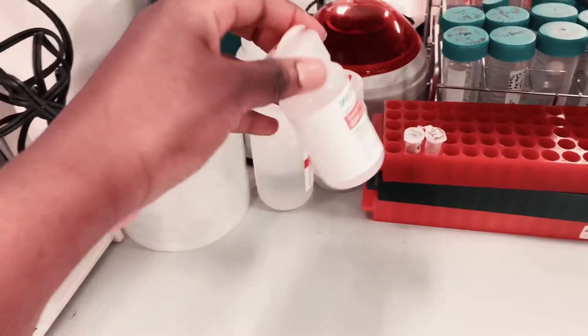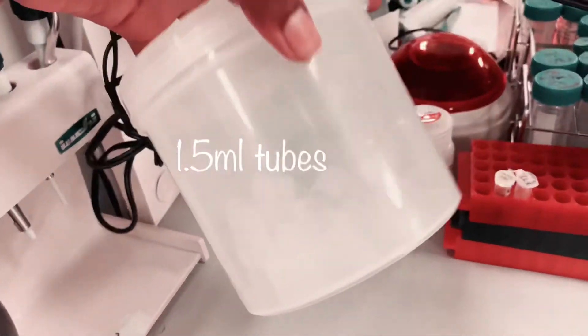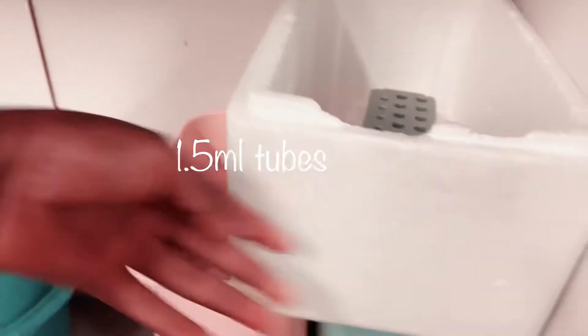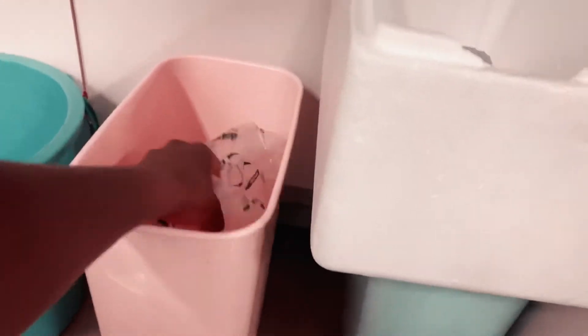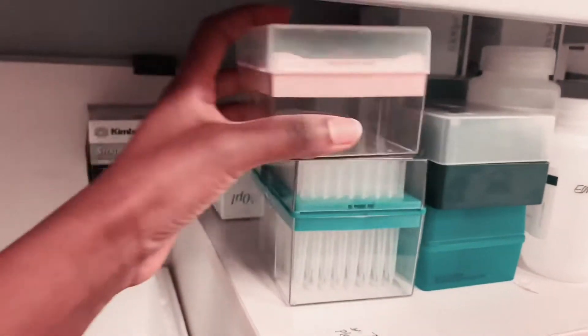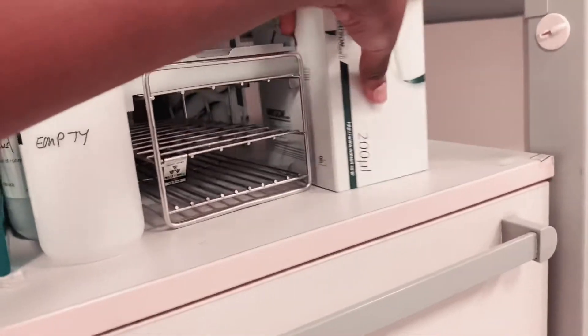I have my tips, my tubes, my solutions, my reagents, my racks. Some buffers — this one is the general one, I should go put it back. I have my tips, and I have extra tips in there as well, plus an extra wrap and more tips for when I want to refill.